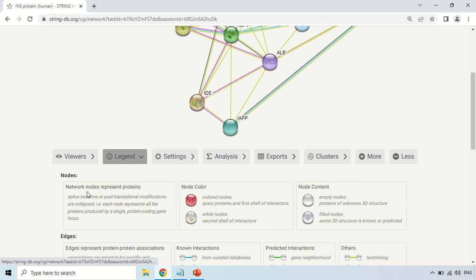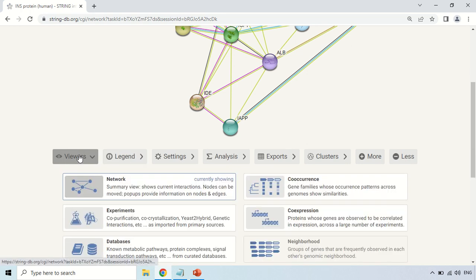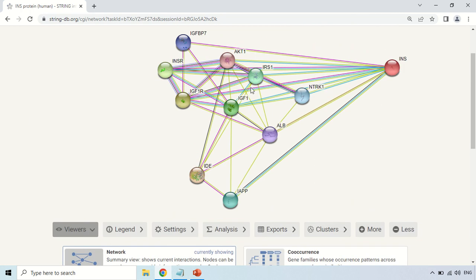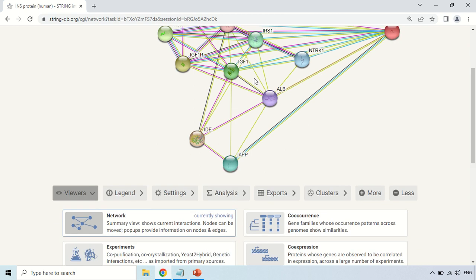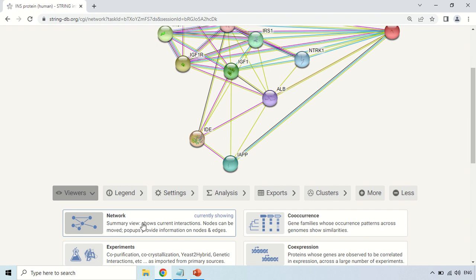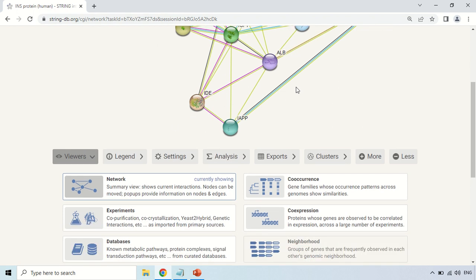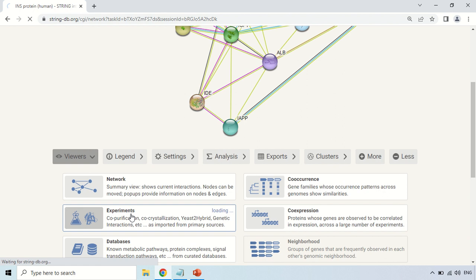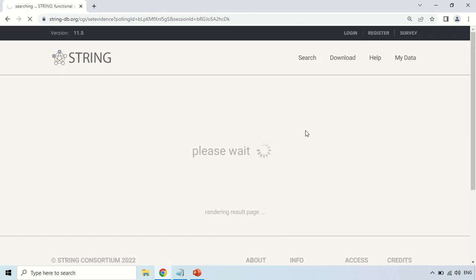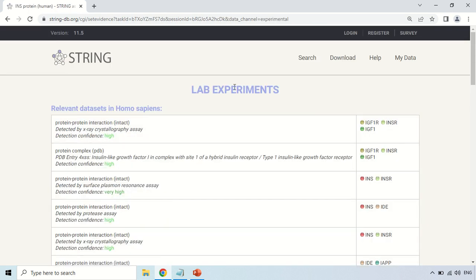Now if we come to another tab, that is the Viewers tab. Here you can see this network in different layouts or forms. The currently selected one is network — this diagram is in network form. If you want to see it in another format, for example if you want to see the interactions at the level of experiments, just click here. On clicking, this diagram will be changed to the experimental layout showing experimental data about these interactions.